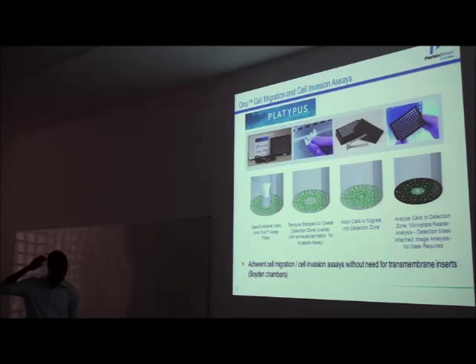This is a different type of assay, cell migration. I don't know if you are interested in this. That's metastasis, for instance, all these kinds of things. But cell migration, you can do it in 2D, but also in 3D. Now we have an application for that.